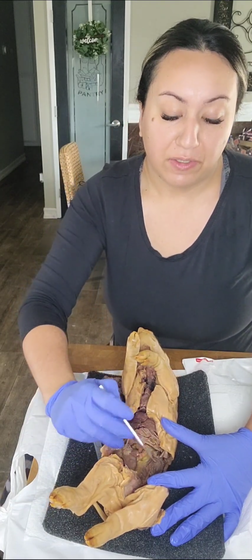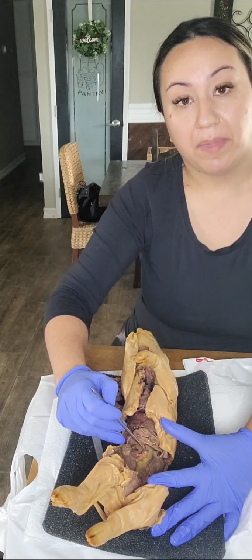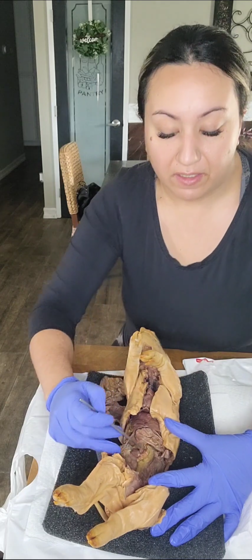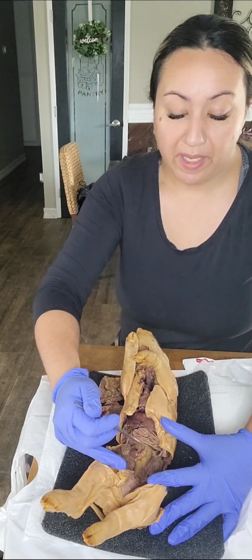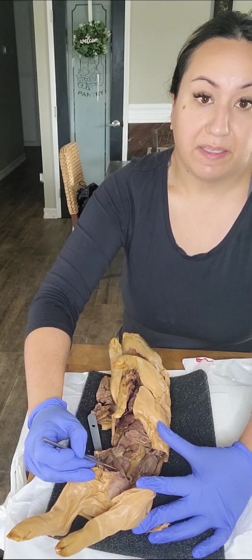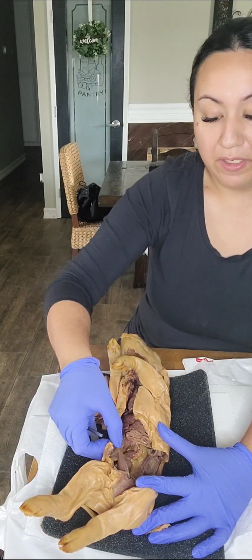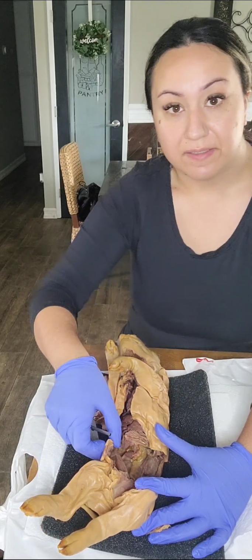And here you can go ahead and see our renal vein and artery that kind of connects. You can see it more prominent on our left side, just from the angle that we're currently in right now. And our bladder here is attached. You can see it right in this area right here. It's kind of attached under our umbilical cord. So I still have it attached for our next lesson for next week.